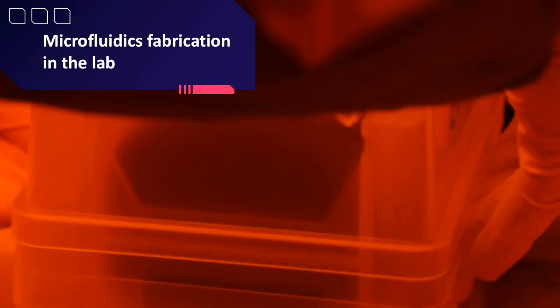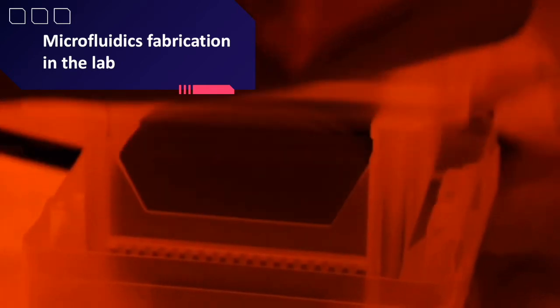This is a video to show the microfluidics fabrication in the lab. After the video, I will break down its components in a simple diagram to help understand the process even more easily. So here we go.